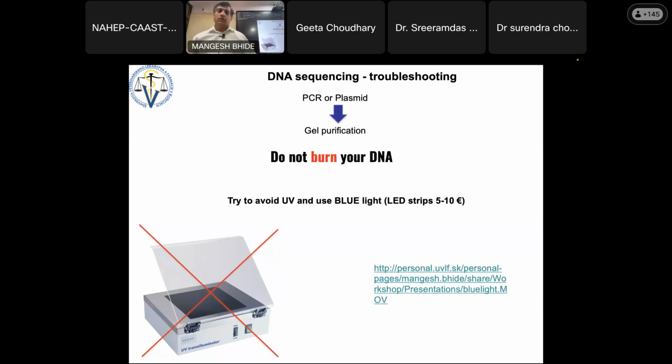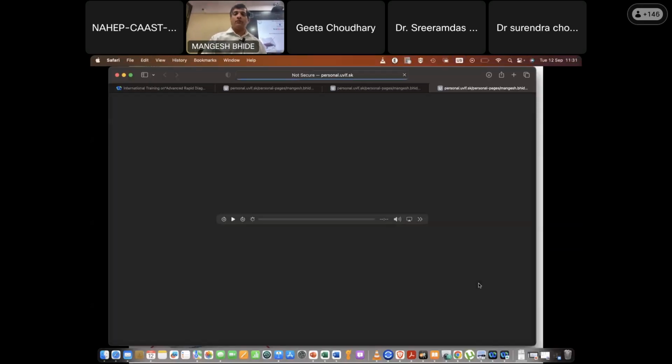Okay. So I recommend you do not use UV. Change your transilluminators. Okay, and it's very easy. I will show you our own transilluminator.